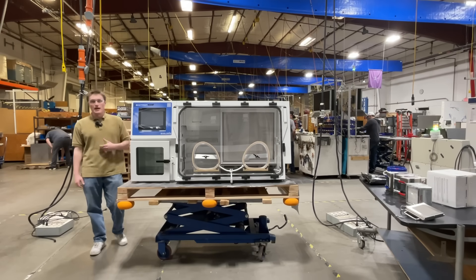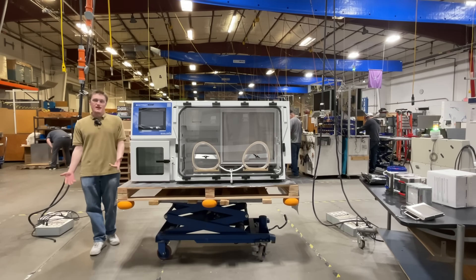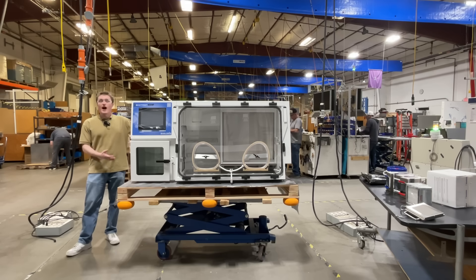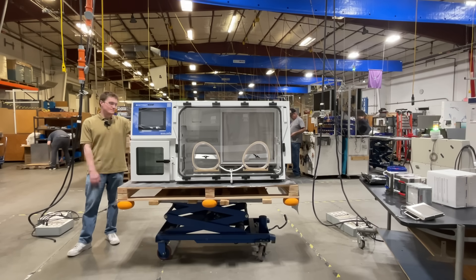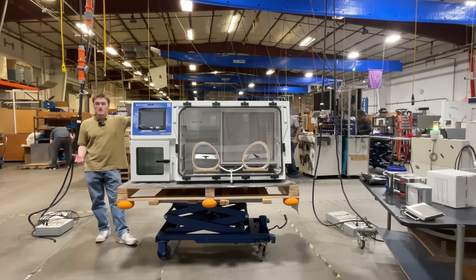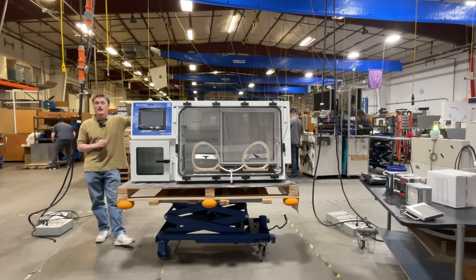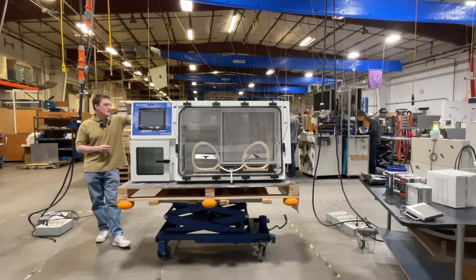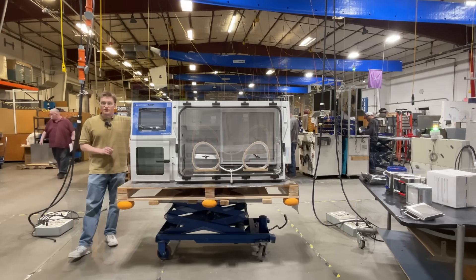Hello, my name is Kord Sanksteak and I'm a design engineer here at Sheldon Manufacturing. Today, we're going to be introducing the Bactron 400 High Performance Anaerobic Chamber. The Bactron 400 fills a crucial role in cultivating anaerobic organisms for microbiology and clinical research. It features a spacious design, user-friendly controls, and precise anaerobic environment.